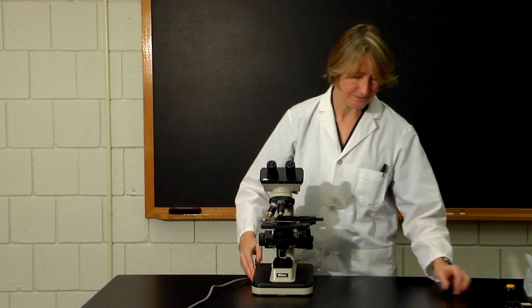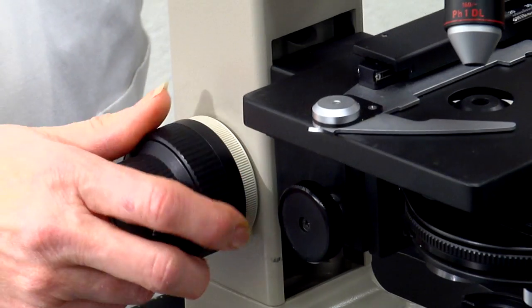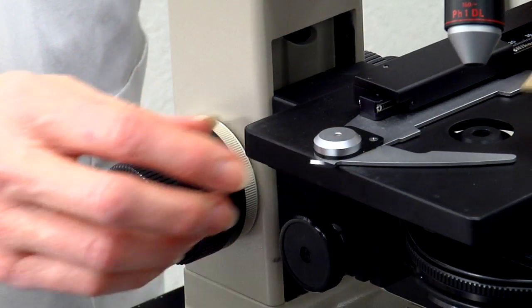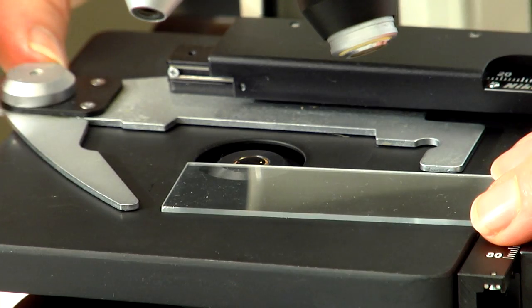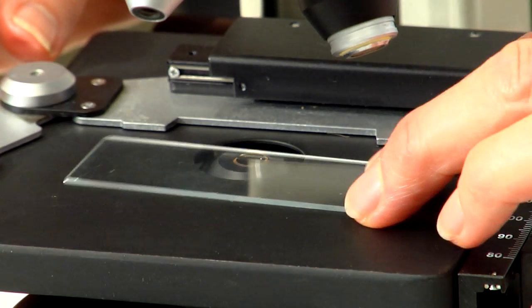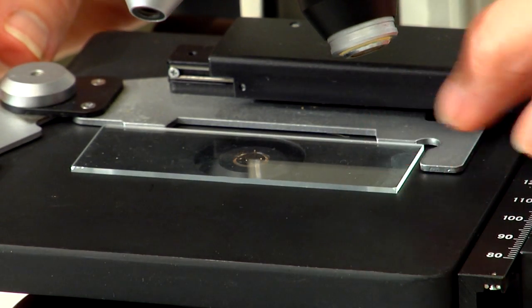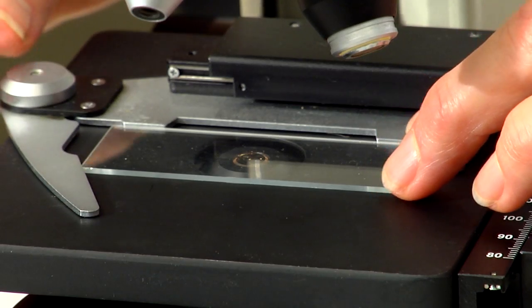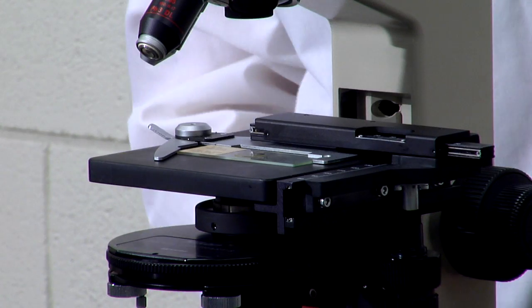Let's place a specimen onto the stage. Lower the stage using the coarse adjustment knob and secure the slide with the mechanical stage clip. Be sure the slide is secured in the clip, not on top of it or beneath it, or it may slip when you try to move the slide around during viewing.